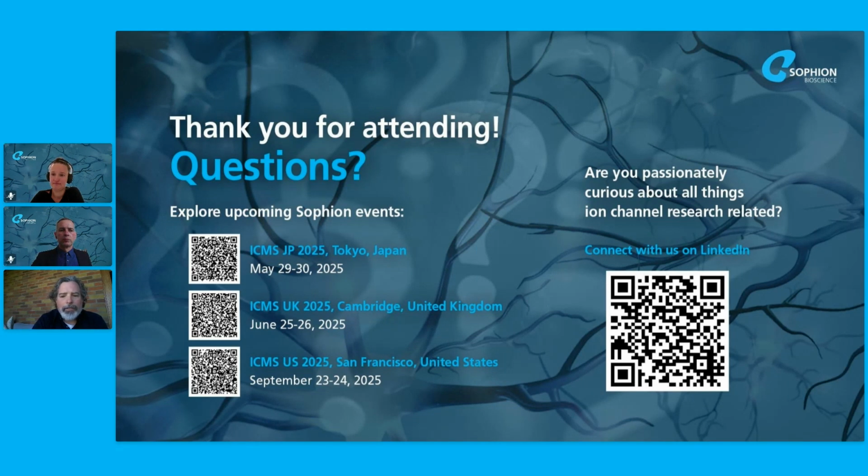But again, we looked relatively early; our RNA data is from an earlier time point, around day 16. So it's possible that at that stage of development, differences may be observed at later stages of culture, at day 20 or day 30, as was looked at with some of the patch clamp data. So, that's one thought. On the other hand, phenotype differences that we observed in the induced excitatory neurons could be more at the protein level rather than the gene level, where it's localized, how much is being translated. But this is a great question. I think there's a lot of experiments that can be done to help try to tie those couple of things together.